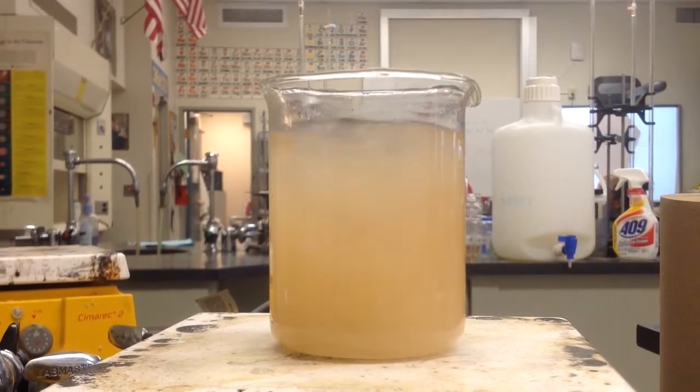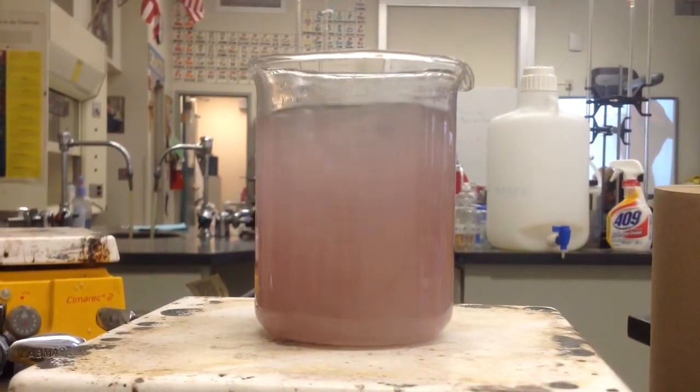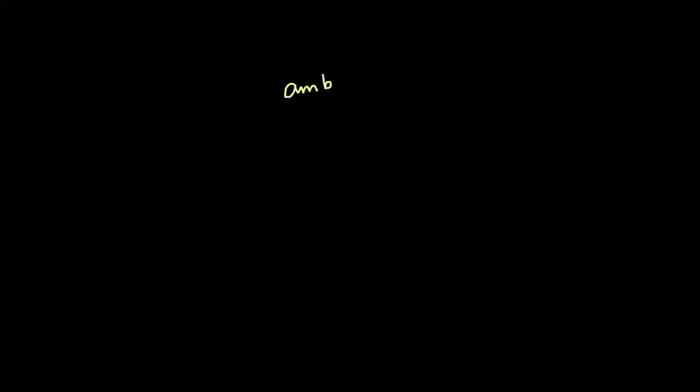This color change, as I've talked about, occurs due to a multitude of steps and complex compounds, which we are about to talk about now. So what exactly is going on with this color change in this demonstration? As you saw, upon the addition of hydrogen peroxide to solution B and solution C, the reaction vessel appeared amber. Then, almost instantaneously for the first cycle, it turned to a dark blue, before that same dark blue shifted to a colorless solution, and then that colorless solution eventually returned to amber.